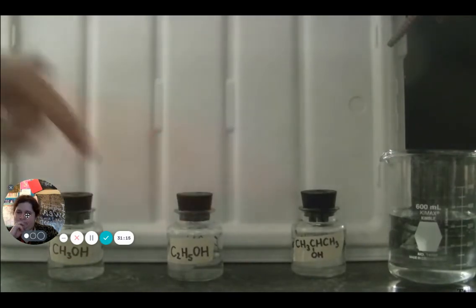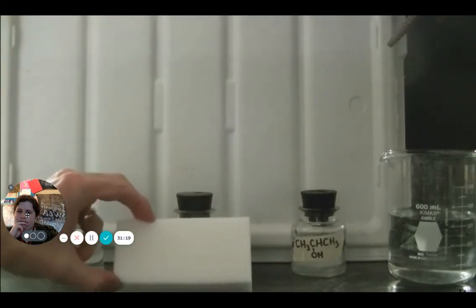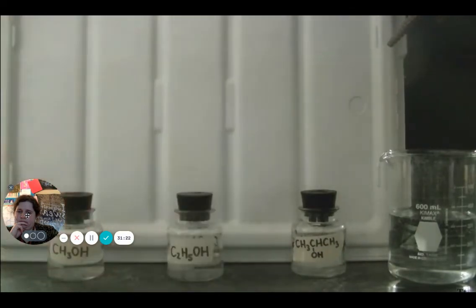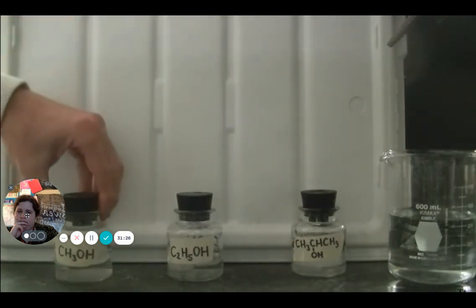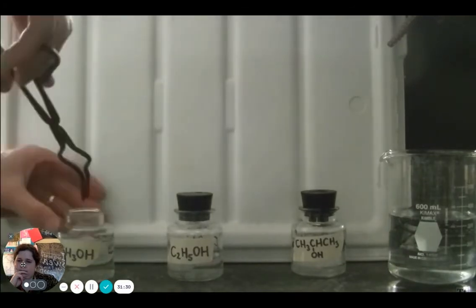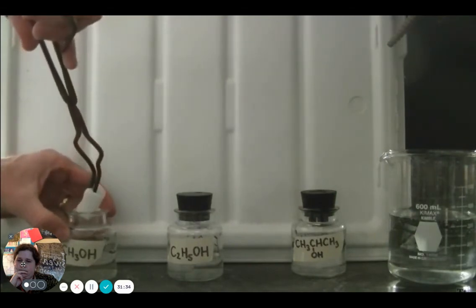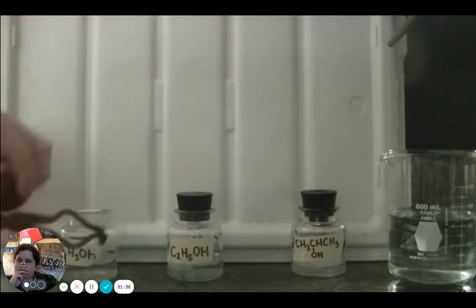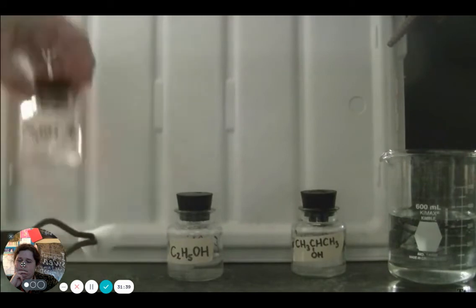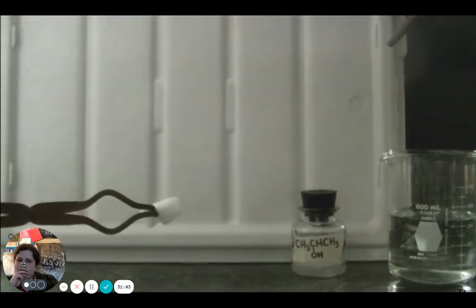In each container, I've placed a cut piece of a Mr. Clean Magic Eraser. And that's going to soak up the alcohol, and then we'll be able to burn them more easily. So first I'm going to test methanol, the 1-carbon alcohol. I'm going to go ahead and remove the piece of sponge, recap the lid, and I'm going to remove the alcohols from the burning area.